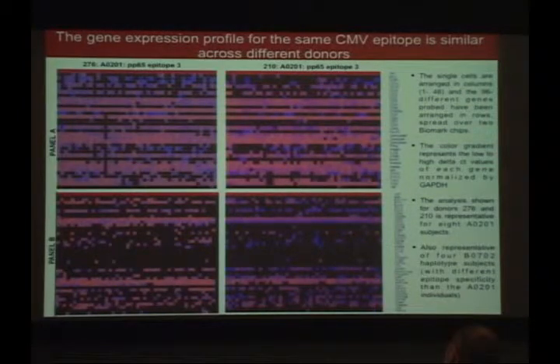even though these are sorted tetramer positive cells. Yeah? When you're analyzing these things, do you look at these visually, or does the machine use an image analysis and just point out where there's a difference? We've been actually doing both. We'll look at them visually, but then you obviously have a CT value behind each of these. You have a whole CT curve, but you can establish a CT threshold and then quantitate it, and you can do statistics to say which ones are actually different.